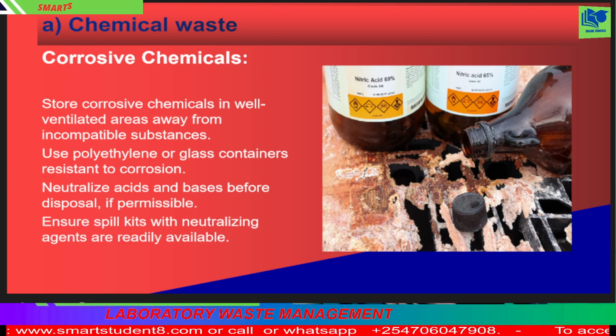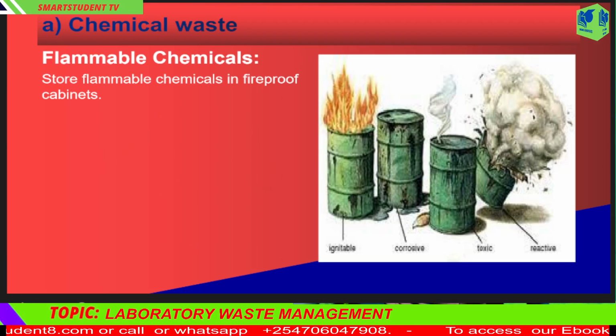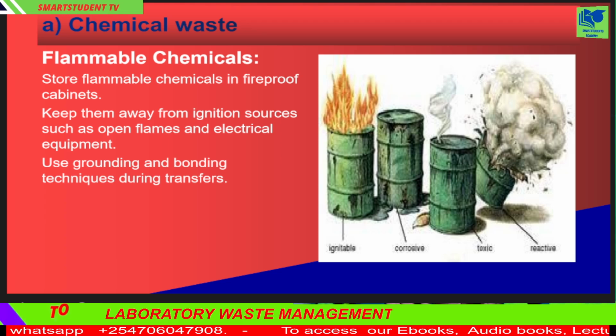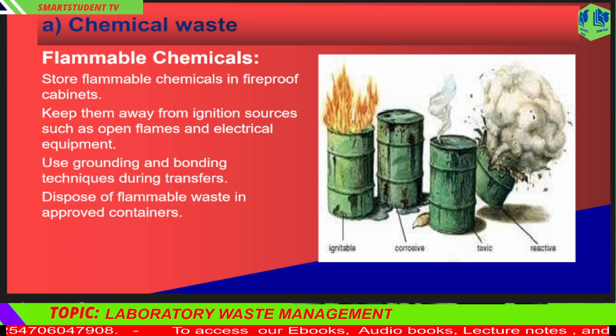B. Flammable chemicals. Store flammable chemicals in fireproof cabinets. Keep them away from ignition sources such as open flames and electrical equipment. Use grounding and bonding techniques during transfers. Dispose of flammable waste in approved containers.